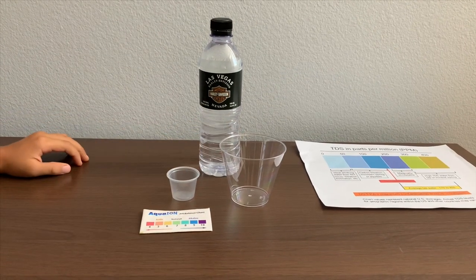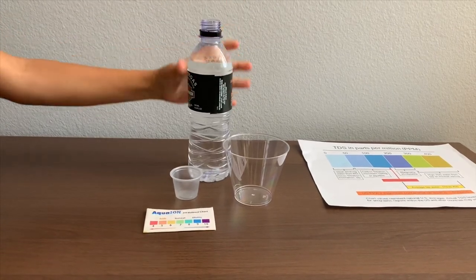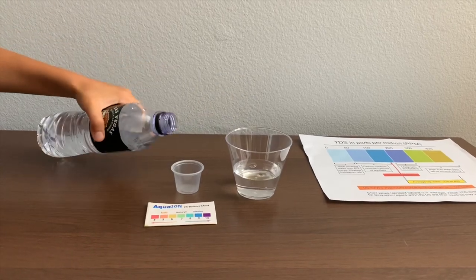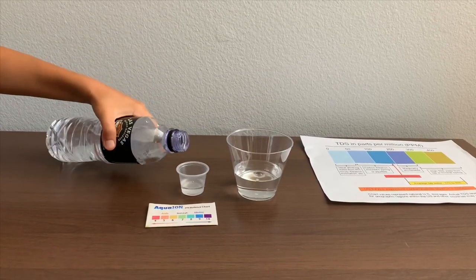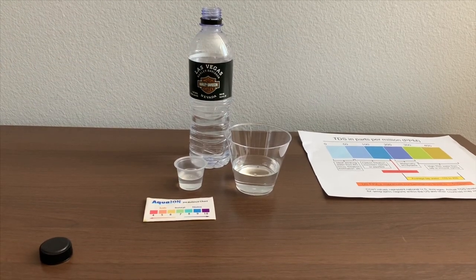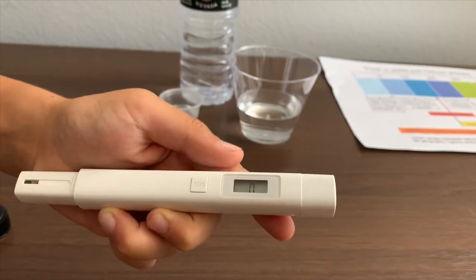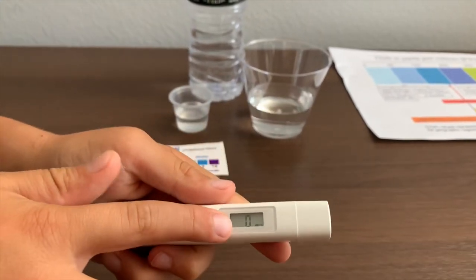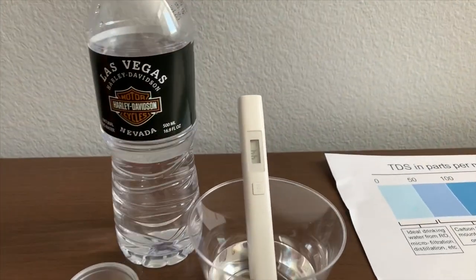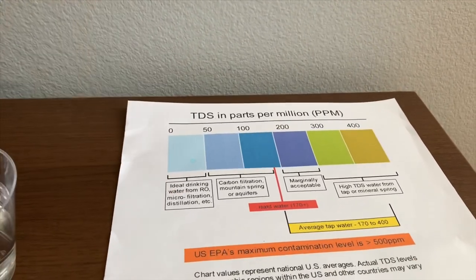Let's test the TDS levels. Let's pour some water in. First, we're going to test the TDS level. If you want to buy this TDS tester, check the link down below. Turn on the TDS tester, make sure it says zero, and put it in. 44 — that is micro-filtered water.